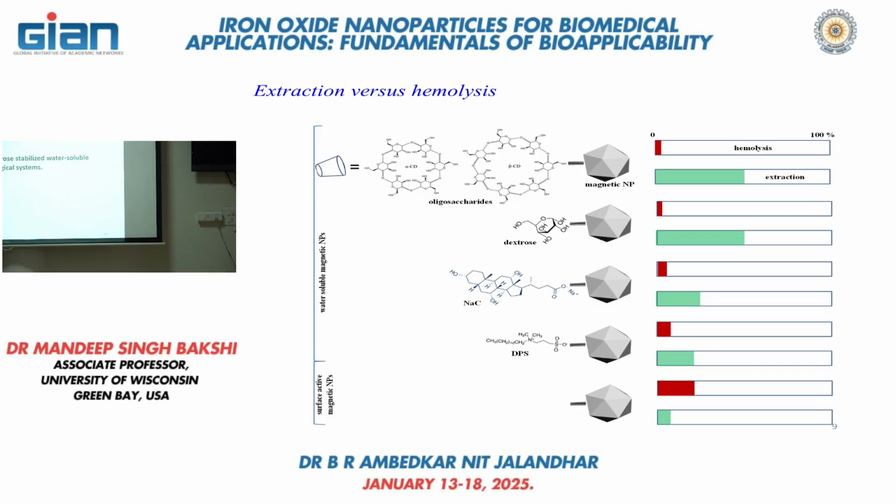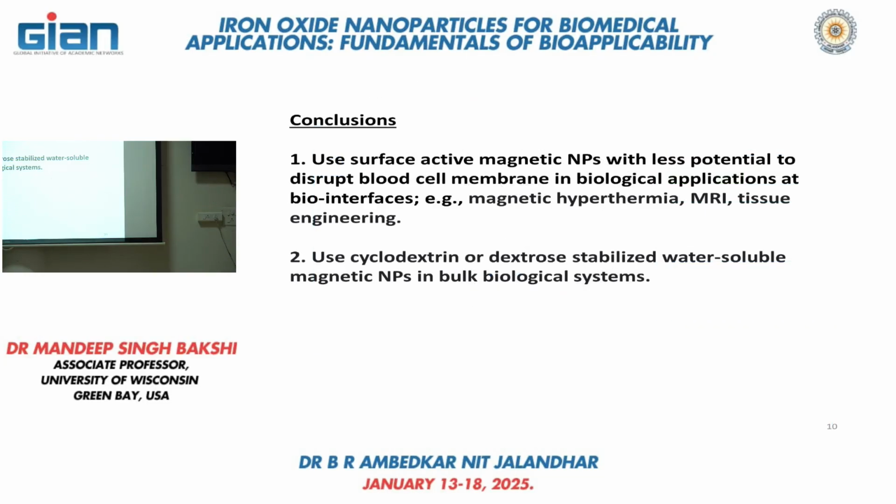Conclusion: use surface active magnetic nanoparticle with less potential to disrupt blood cell membrane. Now, the surface active magnetic nanoparticle I have shown you are not good enough for the extraction, but we need more experiments.